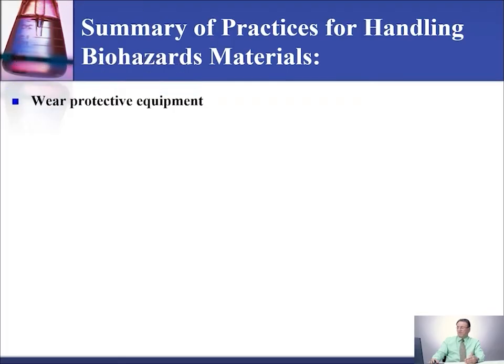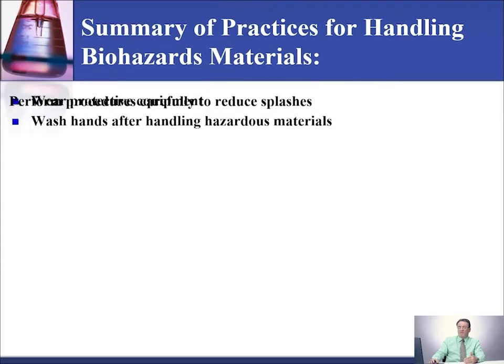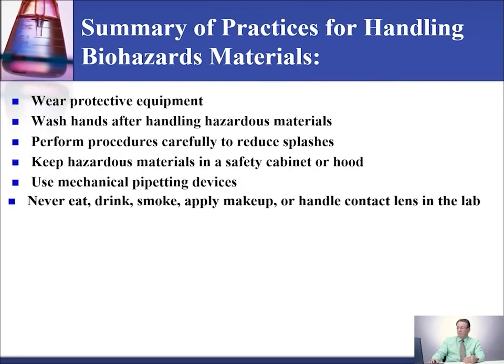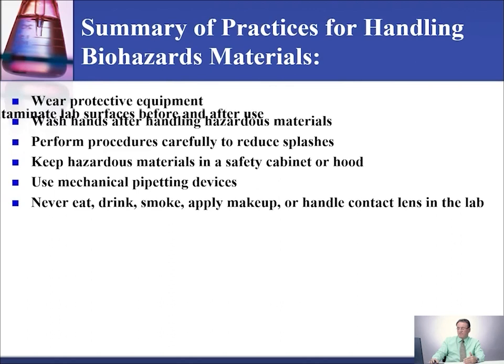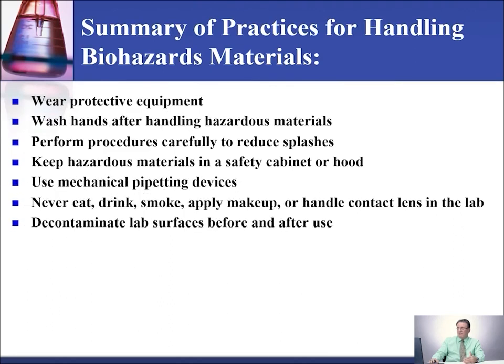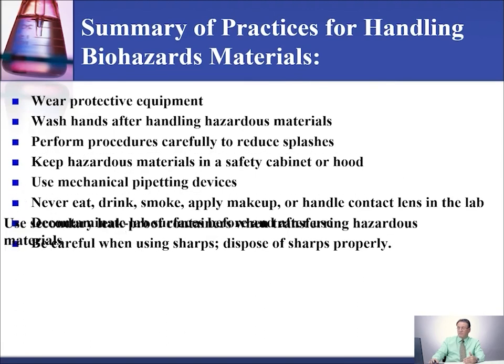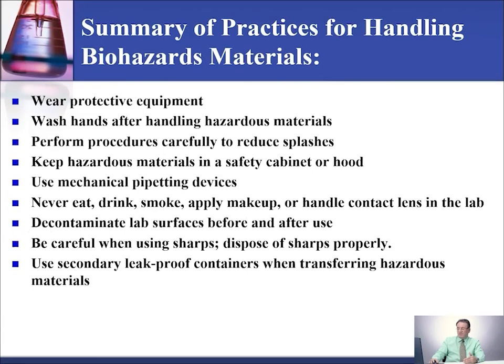Now I'm going to give you a summary of practices for handling biohazard material. Wear protective equipment. Wash hands after handling hazardous material. Perform procedures carefully to reduce splashes. Keep hazardous material in a safety cabinet or hood. Use mechanical pipette devices. Don't use your mouth. Never eat, drink, smoke, apply makeup, or handle contact lenses in the lab. Decontaminate lab surfaces before and after use.